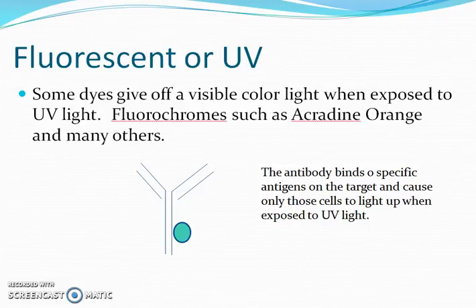But the most powerful use of it is when you combine it with a little bit of immunology. If you look on here, you see the Y-shaped protein there. That's 4 peptides, and they're actually linked together with some disulfide bonding in there. But one of the things you can do with an antibody is you can link a fluorescent dye on the constant region here down at the bottom, the little green dot that's on there.